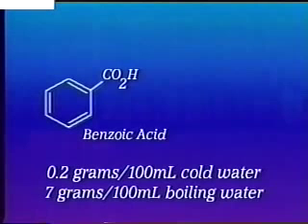Our demonstrator will show the steps of crystallization. The compound to be purified is benzoic acid, and it will be recrystallized from water. Benzoic acid has a solubility of 0.2 grams in 100 milliliters of ice water and 7 grams in 100 milliliters of boiling water. Consequently, water would be a good solvent for recrystallizing benzoic acid.